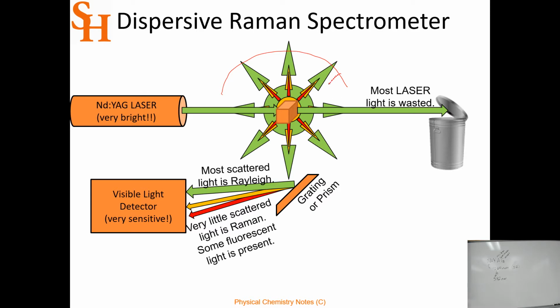So that light bounces off and goes back this way. And then, think about a parabolic reflector, where that is the center of that parabola. You can do it like a semi-spherical cup here, or you can put it in the center of a parabola so that all that light comes out and is collimated.